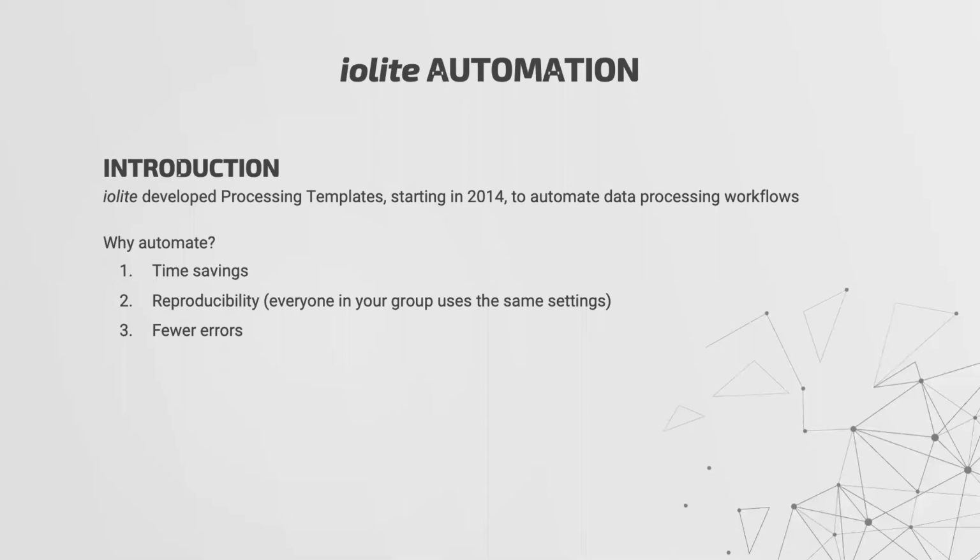Even those people who love to do things manually will have to admit that they sometimes make mistakes, myself included, with clicking buttons and typing really fast. In fact, I make heaps of errors typing really fast. Even if you think you're a fast clicker, you make more mistakes than automation will.